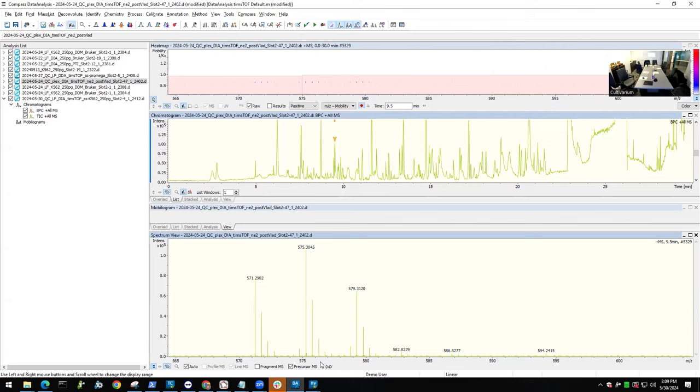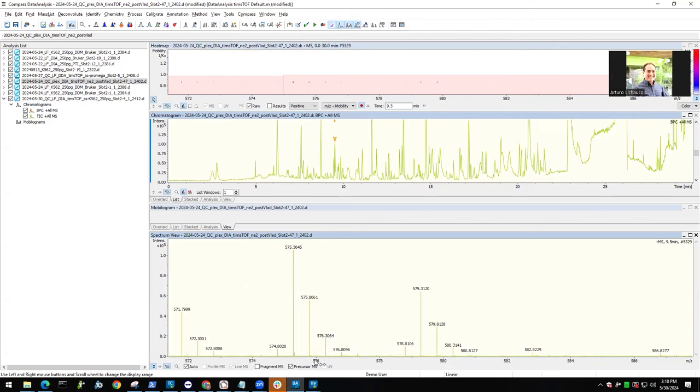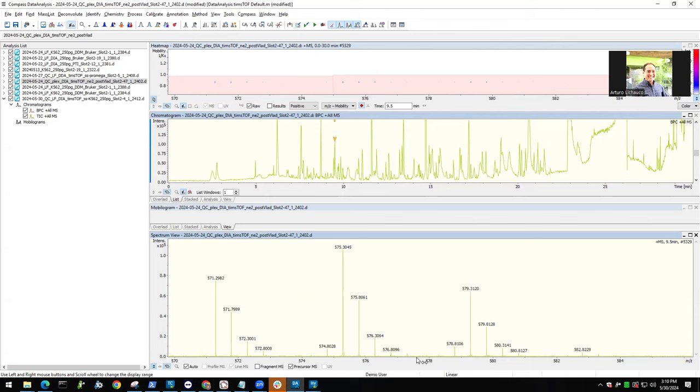Then this is a triply charged molecule. Sorry, I was a bit too quick. From here to here, and from here to there, it's basically that plus 8, or it has two labels. So then you would have the N-terminus labeled and the side chain of the lysine. That's why you have plus 4 and plus 8. It's a doubly charged one, but it has the N-terminus labeled and the side chain of the lysine. Now this is just on the MS1 level. The MS2 level would look a bit more complex than this.